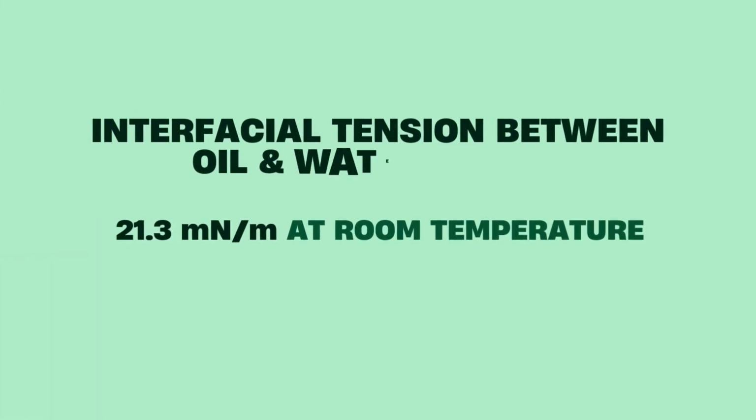The result for interfacial tension between water and oil is 21.3 millinewtons per meter, which indicates a moderate interaction between the two liquids. This value is important because it reflects how easily the water and oil can separate or mix.